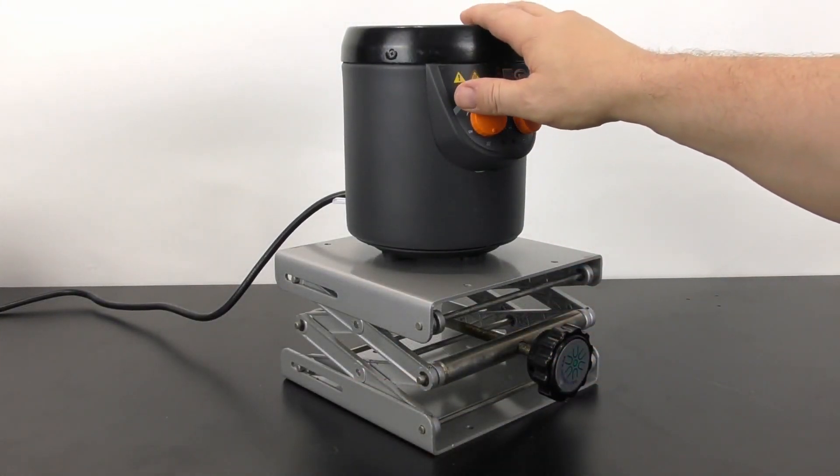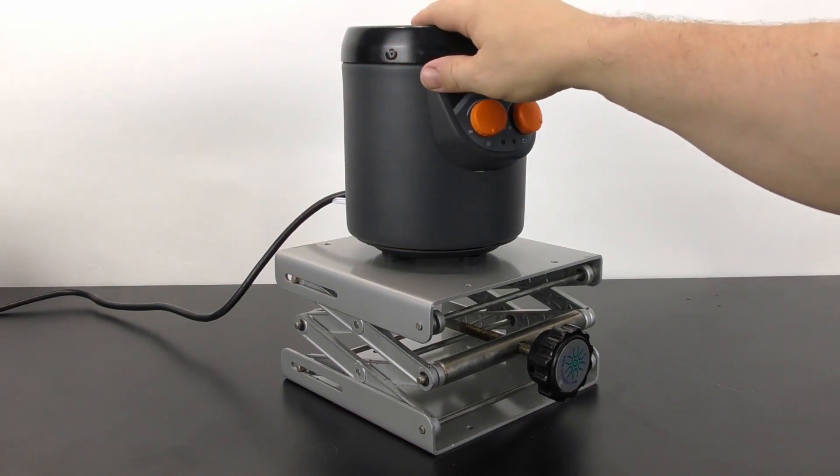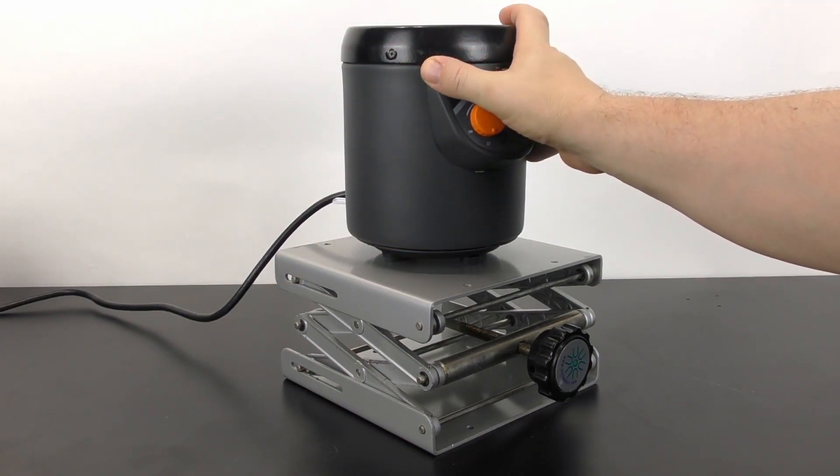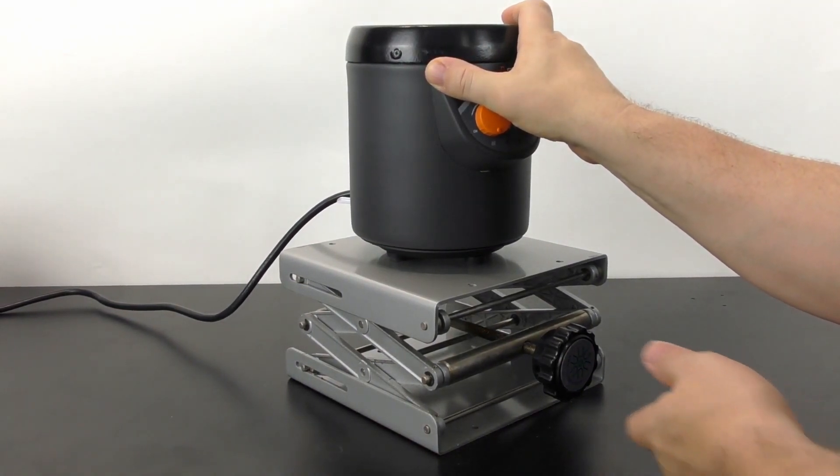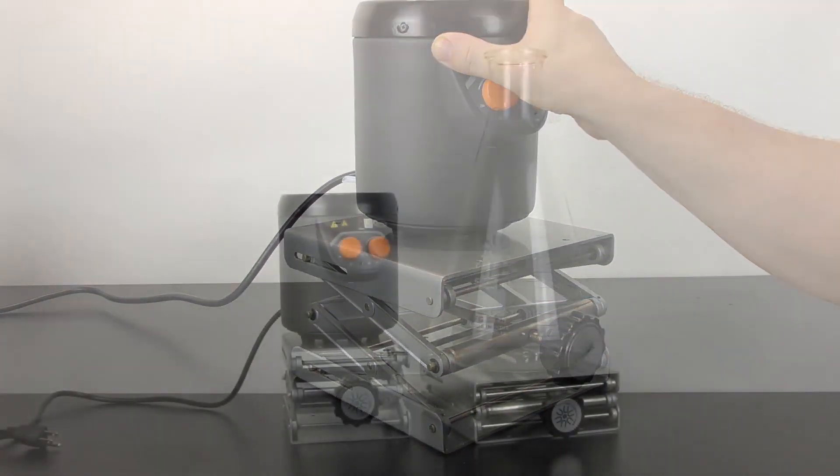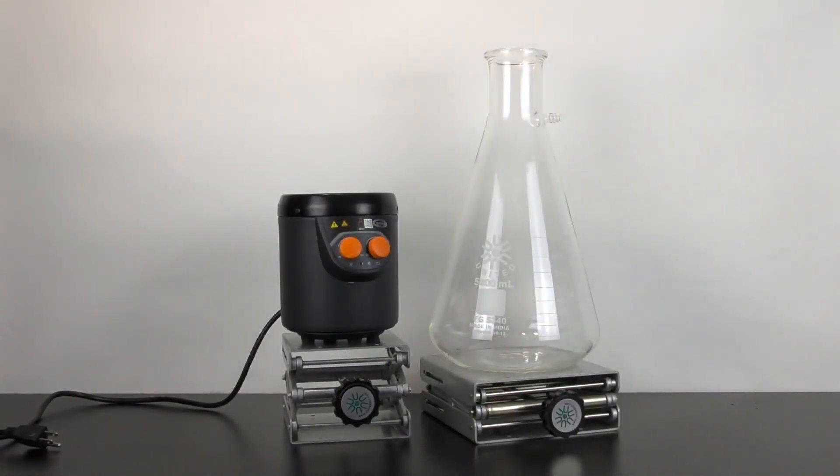If you need to adjust the height, either remove the apparatus first or place one hand on the apparatus and use the other hand to adjust the height. There are three different models to choose from, each one has different specifications which are as follows.